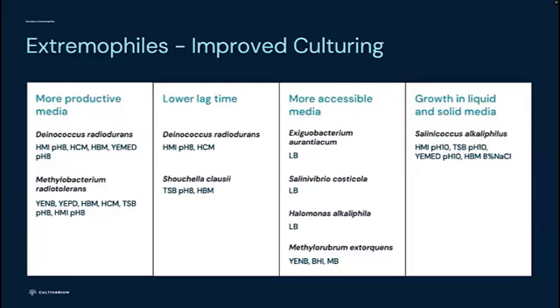Some of the key takeaways for this set of extremophiles is that we were able to suggest more useful media than what the depositors initially submitted to ATCC, which is very interesting. For some organisms, we identified a more productive media that yields more biomass compared to the suggested media.